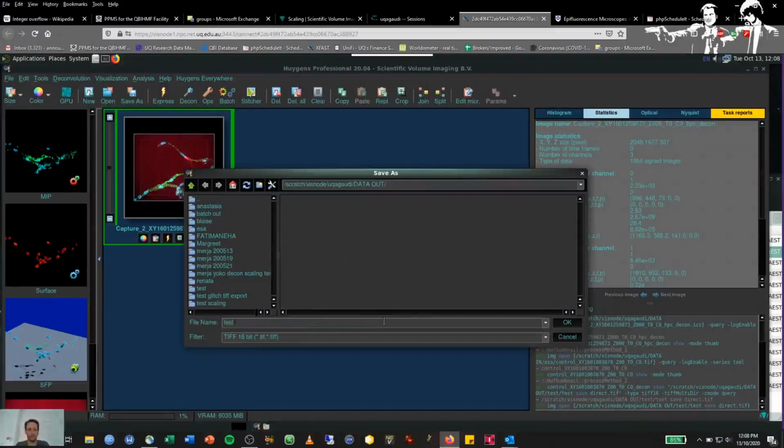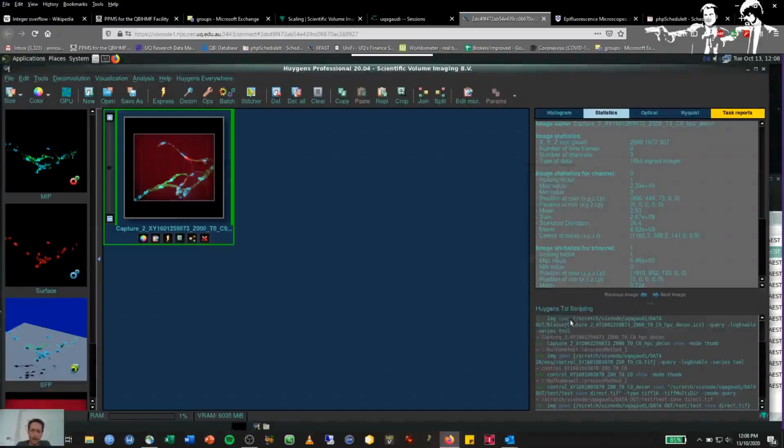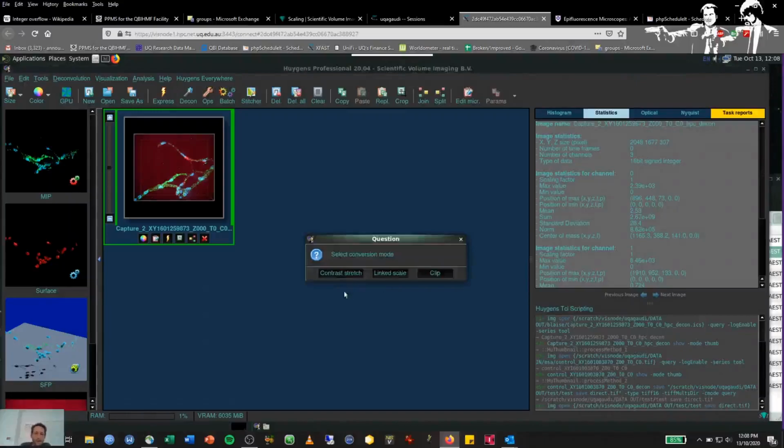Somewhere, test one, whatever, and go OK, and that will prompt you this question about the select conversion mode. So what I'm going to do is try to demonstrate quickly the difference. I will probably accelerate the video at this point because nobody wants to watch loading screens for half an hour.